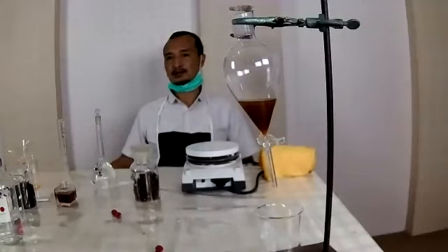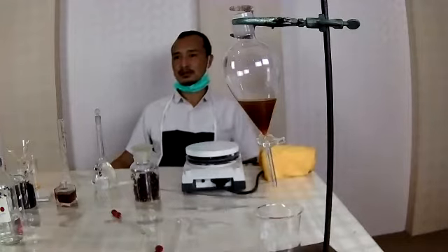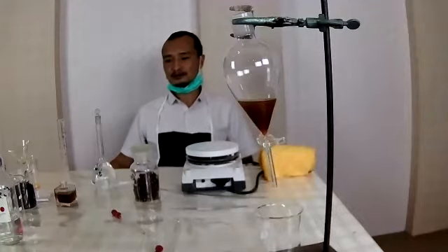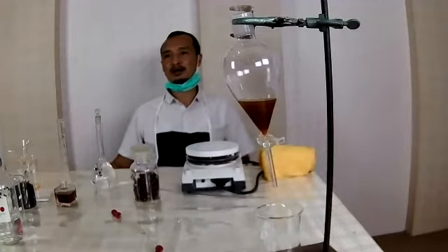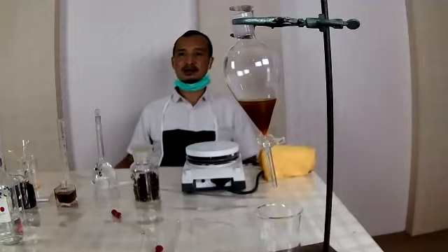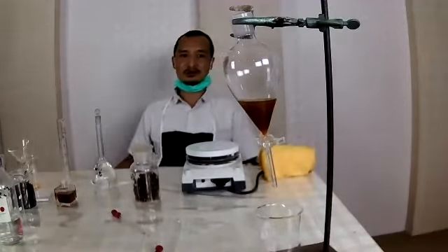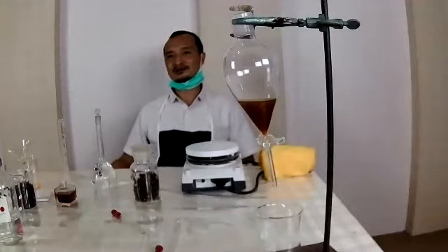We are going to try out the citronella extract. We were experimenting, and we made the citronella emulsion as well, and also how we can extract the properties that are useful for our work. We will also select some test areas, maybe areas that are not part of the temple, where we can conduct a trial using these other extracts.